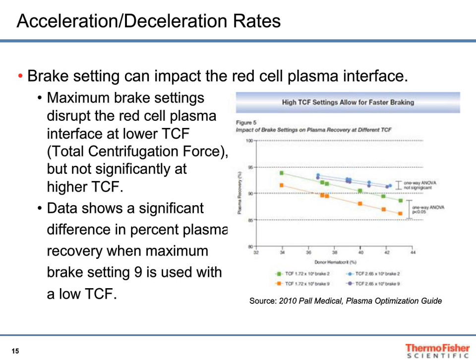I guess there have been cases, although they're rare, where you get no result, and that's obvious. But I think often people are sub-optimized. They're getting a result, they're living with it, not realizing if they would take a little bit of time, do a little bit of work up front, they could get a much better result. And the accel-decel curves help with that.